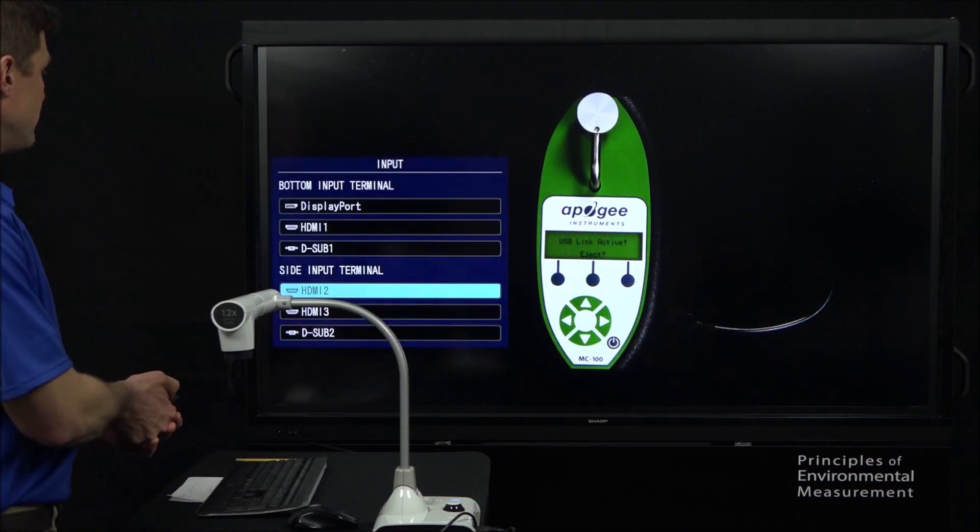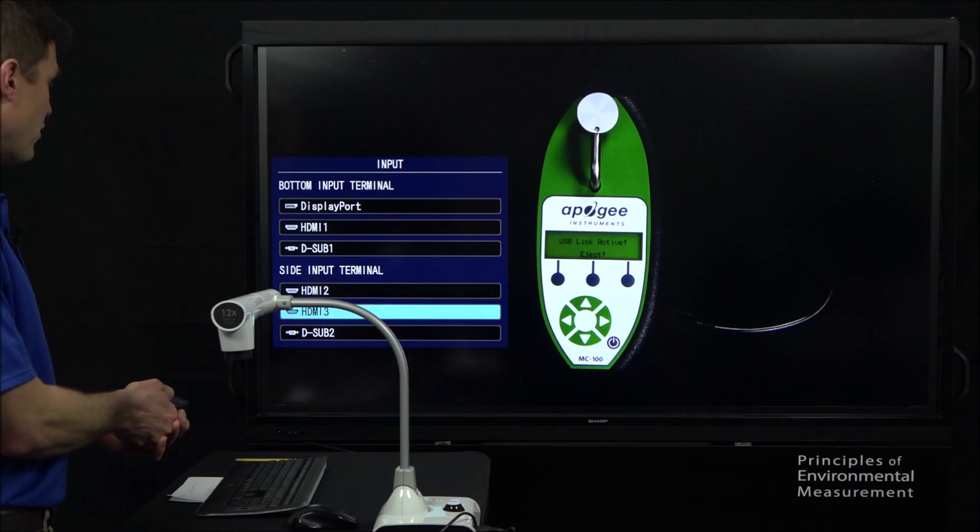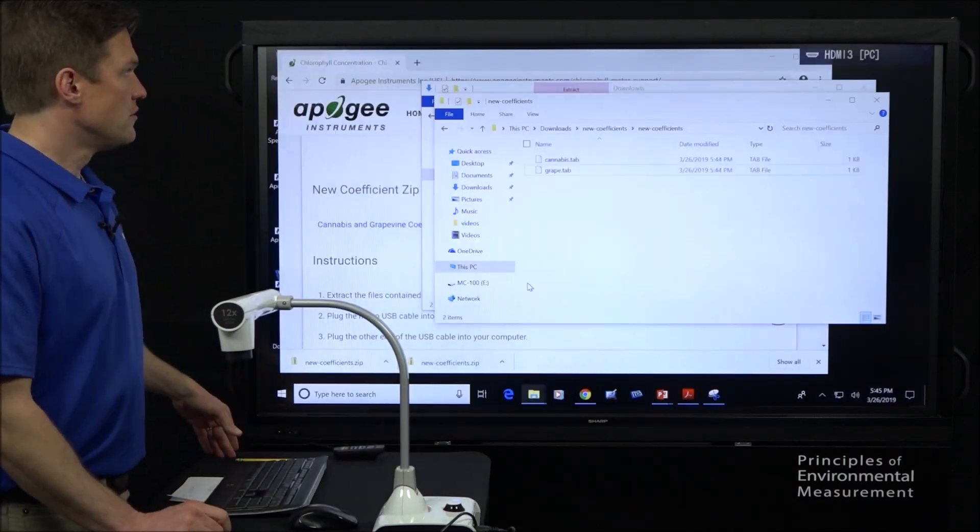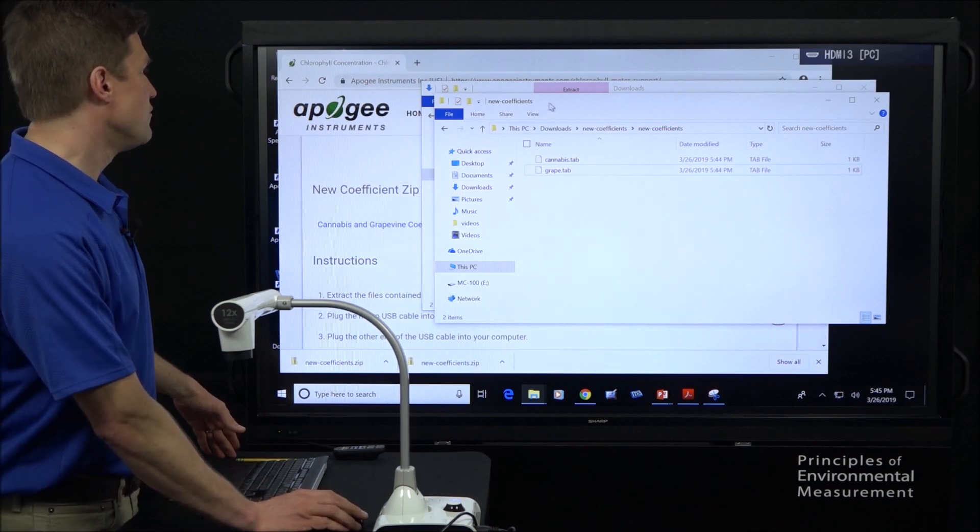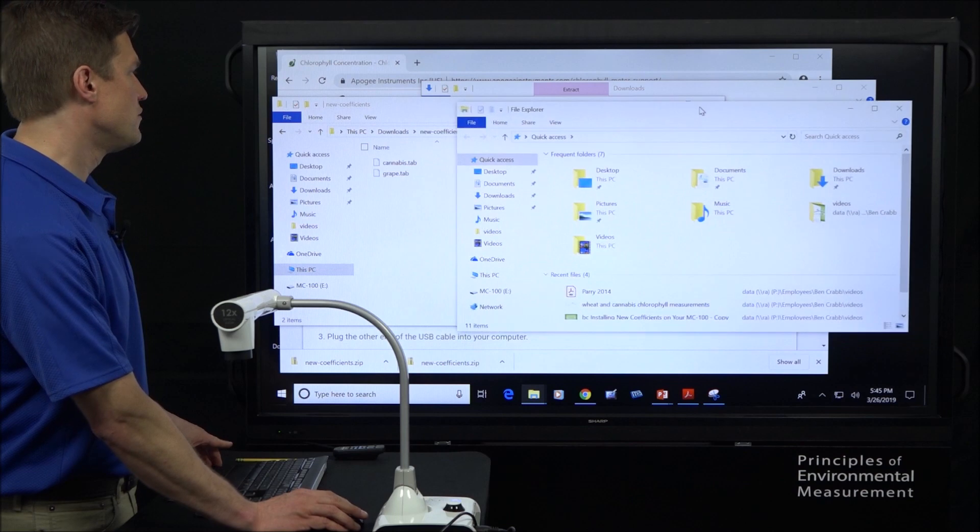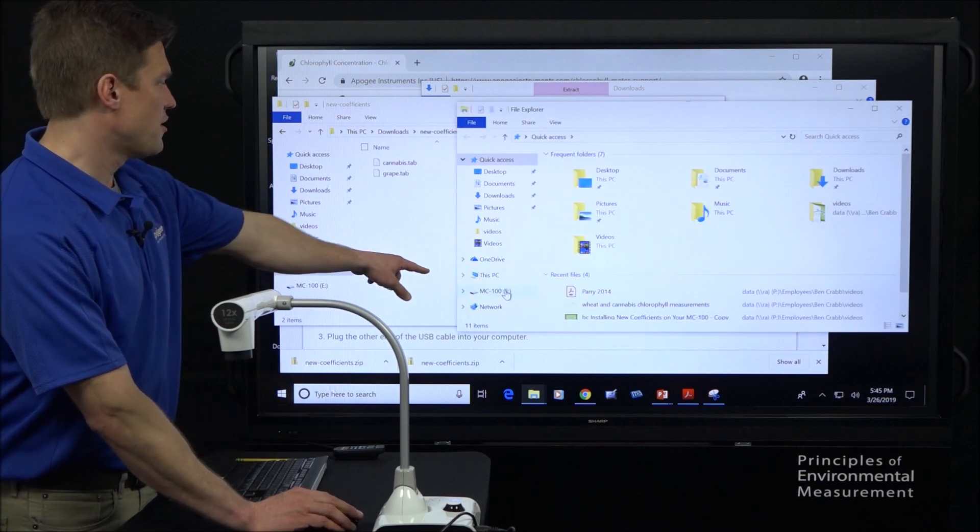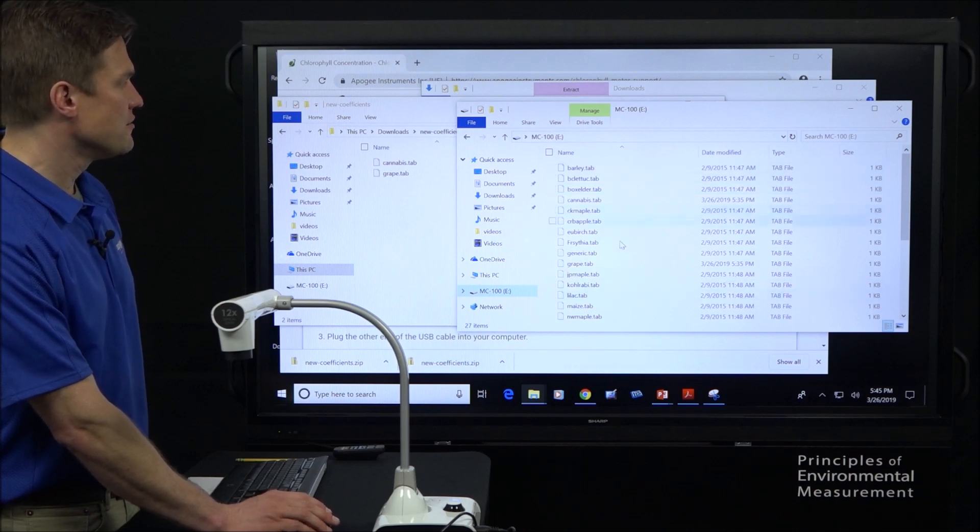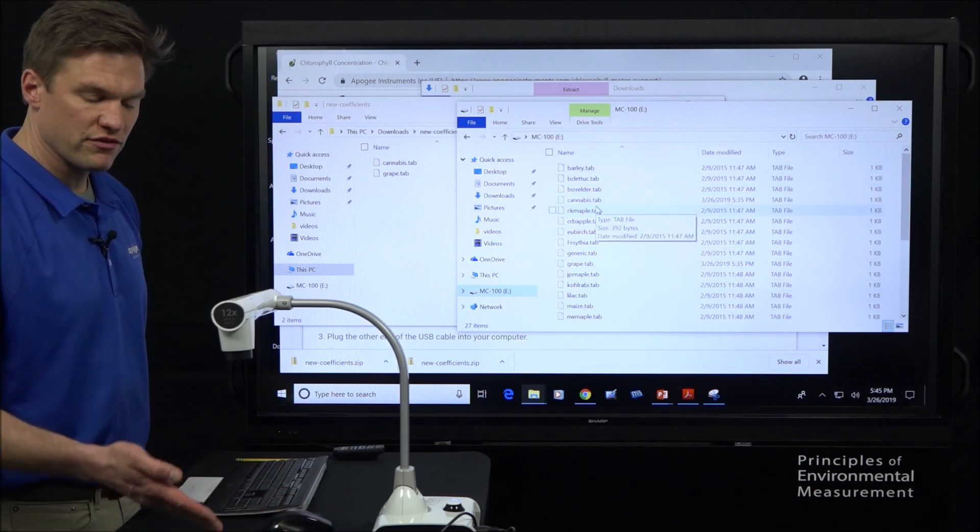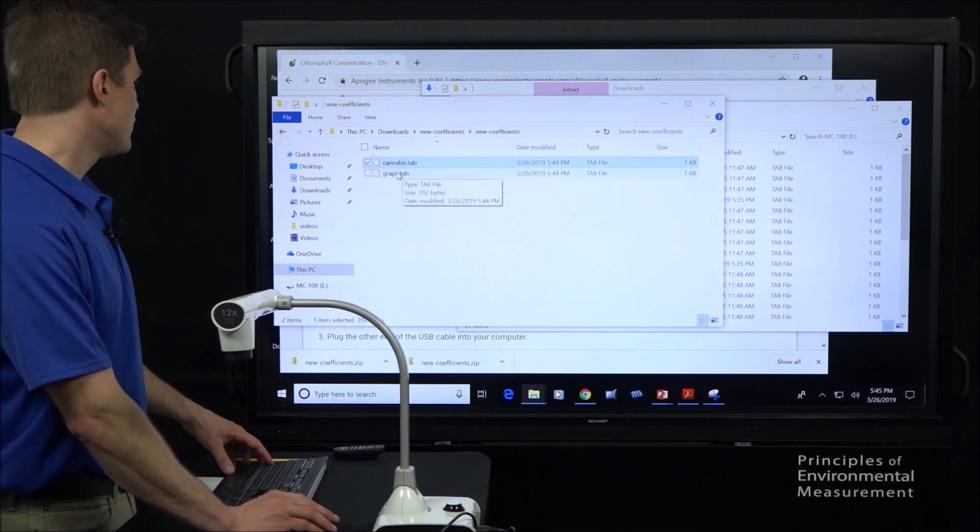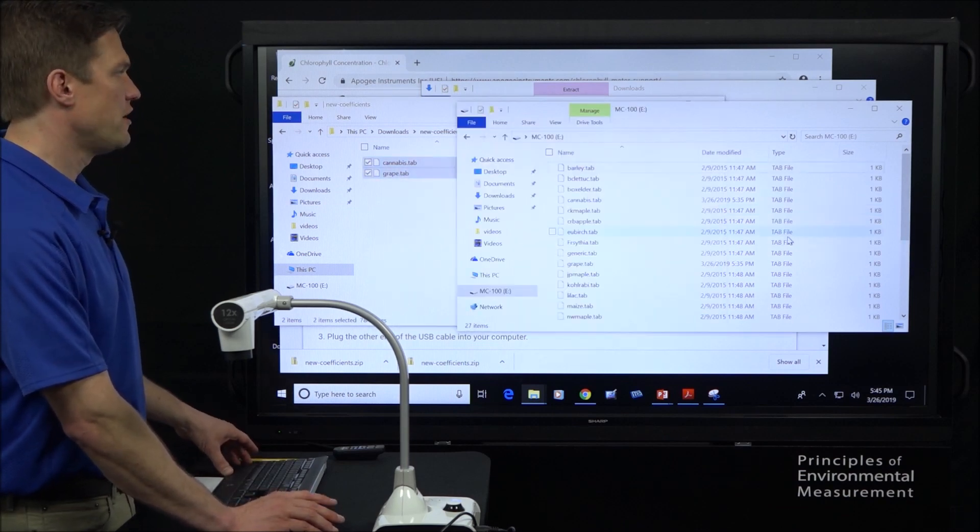Okay, so this means that it is connected to the computer and you ought to be able to access the relevant folder now. So switching back over to the computer view, we'll open up another explorer window and we can see we have an option, MC100. So you open this up and you see a bunch of other .tab files for all the other species that have coefficients already loaded onto the meter. So all we're going to do, we're going to take these two files and we're going to drag them in.